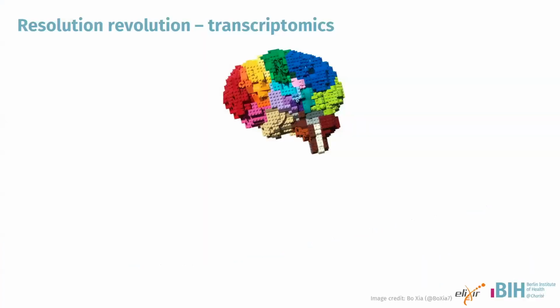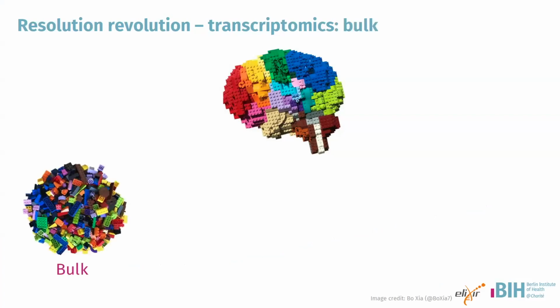I have a few slides. I don't think we need them, but they're really nice slides of how we can represent transcriptomics at different levels. Over here, we have an anatomically accurate representation of the human brain with different cell types distributed spatially. These will form tissues that have some sort of function, which communicate between cells and allow the brain to function as it does. Traditionally, we've been doing mainly bulk sequencing. If you're familiar with this kind of fruit smoothie analogy, this is essentially the fruit smoothie.